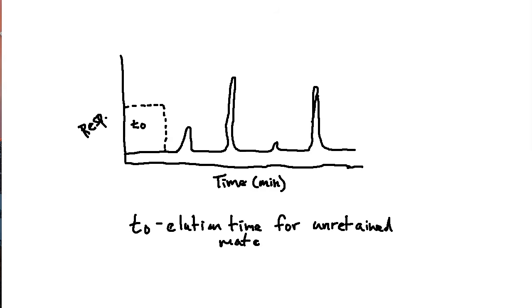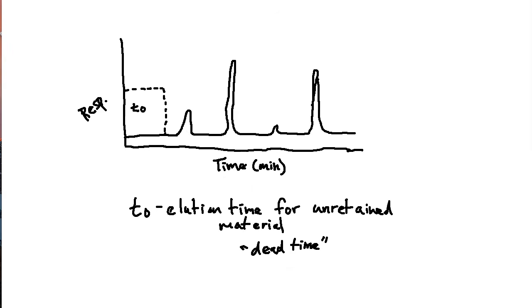And when you have that, sometimes you'll hear it called or referred to as dead time. Again, this is simply time that elapses when you have essentially the first dump of mobile phase into the detector that did not have any type of adherence to the column.